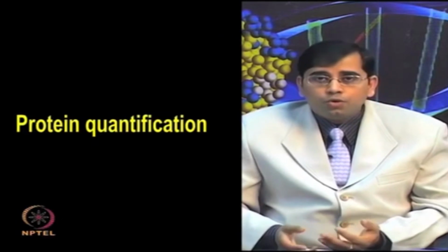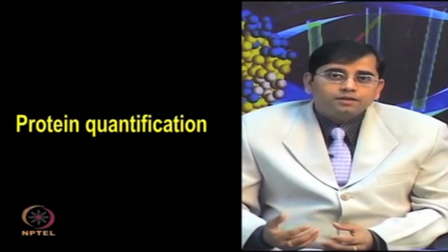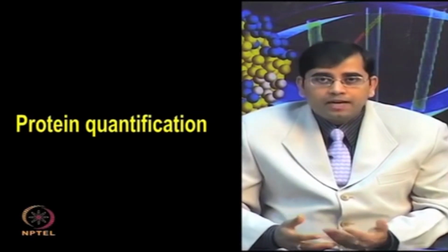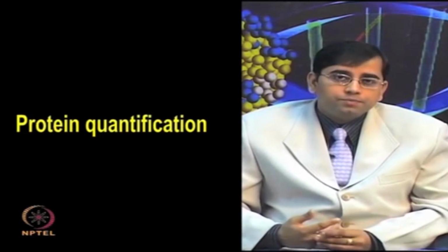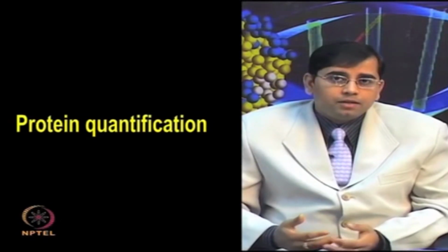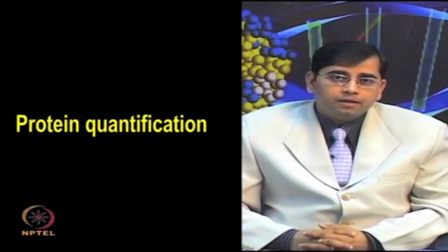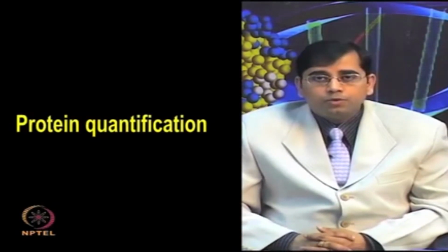Now, you want to know how much protein you have in your sample, whether you can perform your experiment with that protein or not. So, one needs to know the protein quantity present in the sample. There are different types of protein quantification methods available. We will talk about protein quantification in detail now.